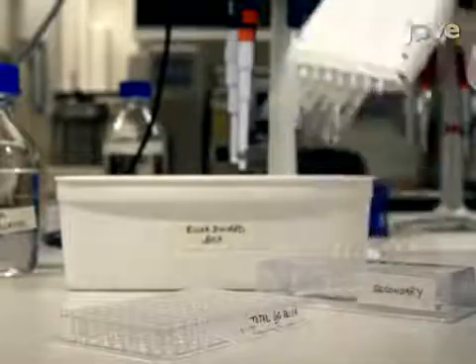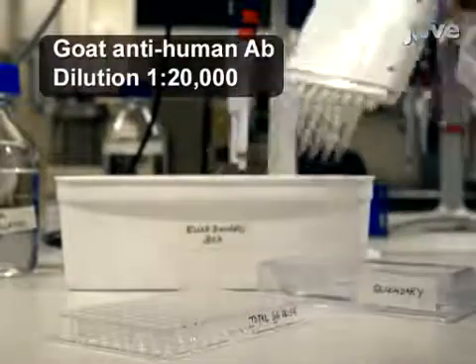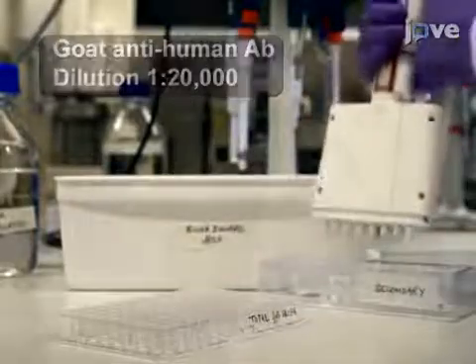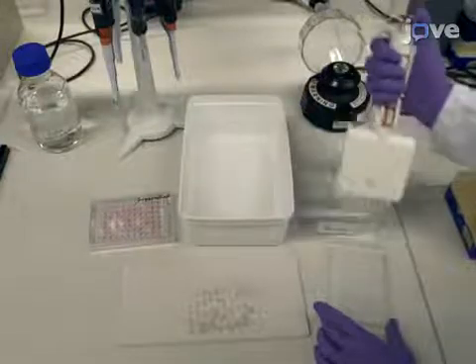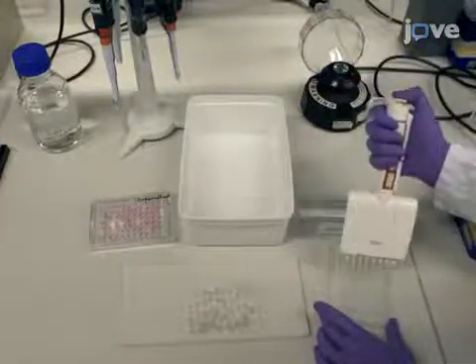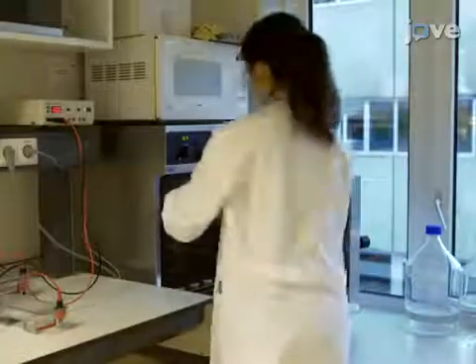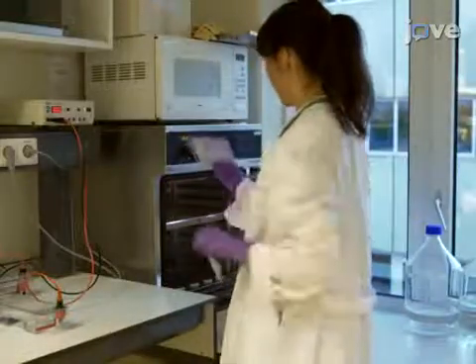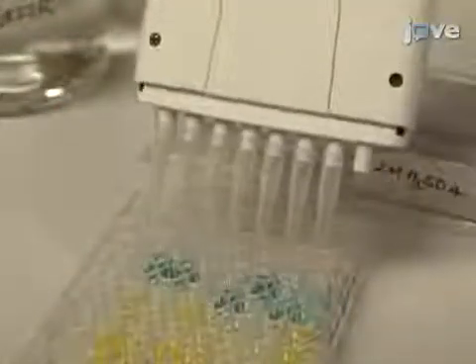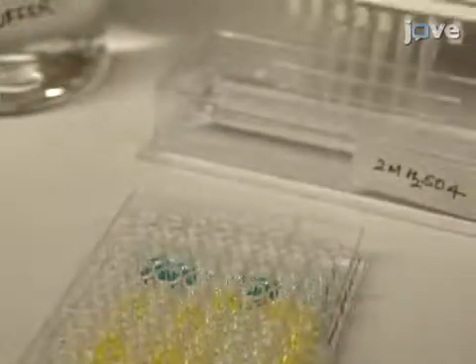Then, to each well, apply 50 microliters of incubation buffer with peroxidase conjugated Fab2. After another hour of incubation and another wash, add 100 microliters of substrate solution with TMB to each well. Then, incubate the plate up to 10 minutes until the blue that appears stabilizes. Then, stop the reaction and measure the absorption.